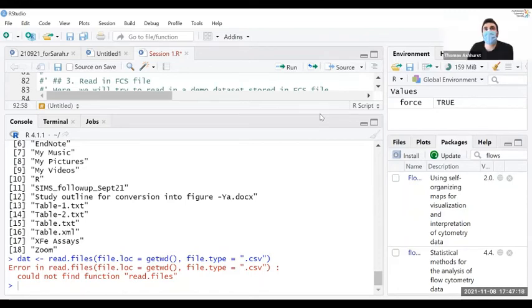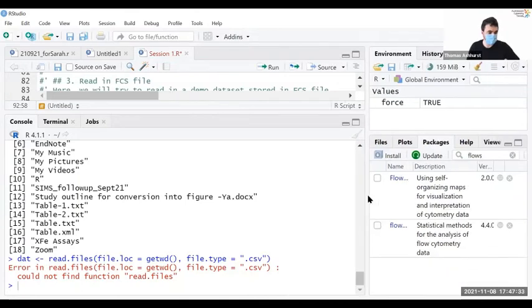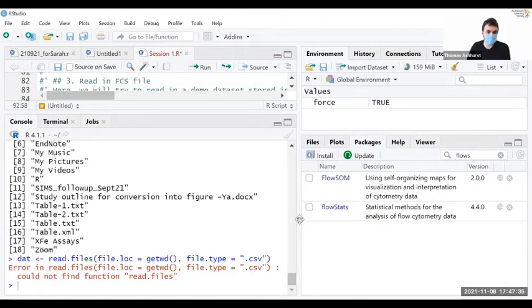So it looks like we want to double check that you've installed Spectre. So the package. It can't find a function. Generally, it means that either the package that uses the function hasn't been installed, or it may not be open yet. Okay, so should I do the library? Yeah, the library one.